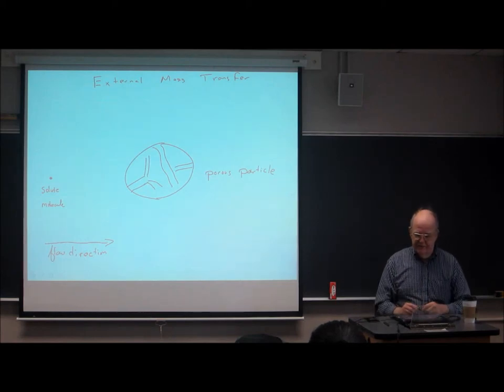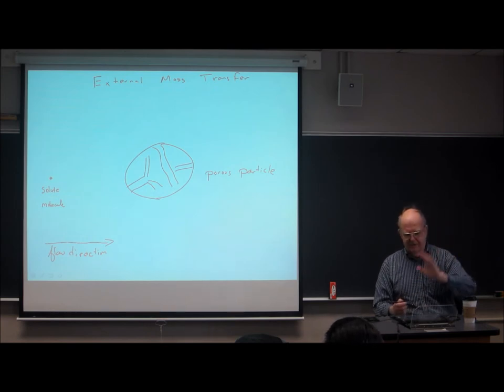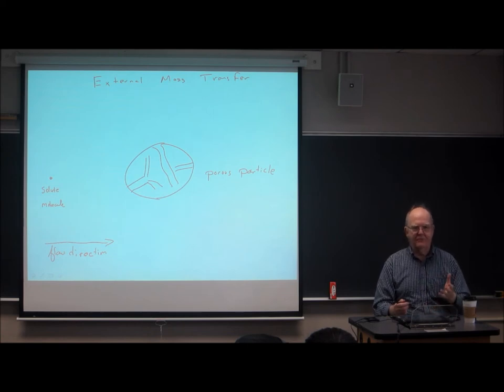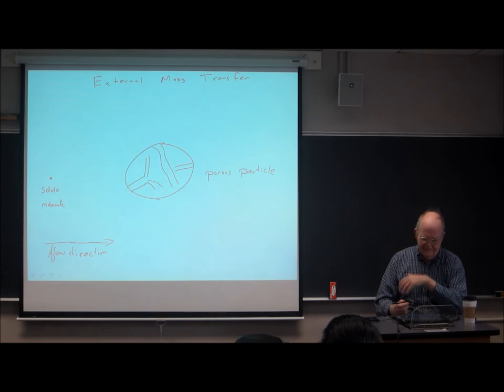So I think I better just spend a few minutes and go back over some of the things that I may have glossed over. What do I mean by external mass transfer? Okay. We had a molecule of solute out here somewhere in the fluid phase, in the mobile phase, outside the particle. It's external to the particle. Where it wants to go, because the stationary phase is inside the particle. Okay, so there's a driving force for the solute to go inside the particle.